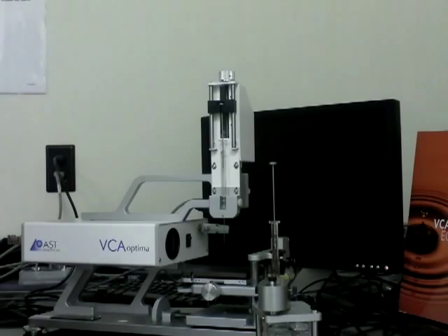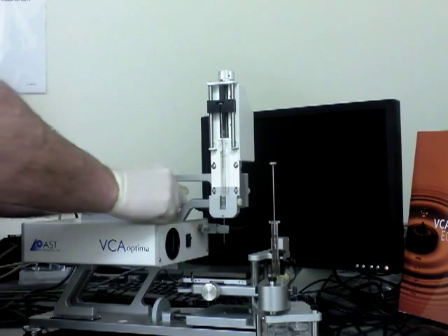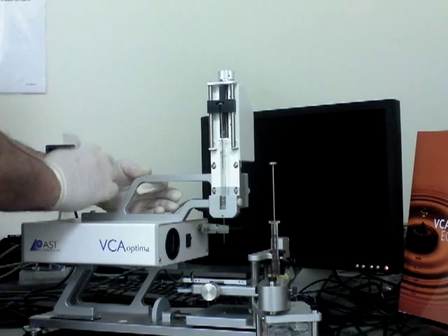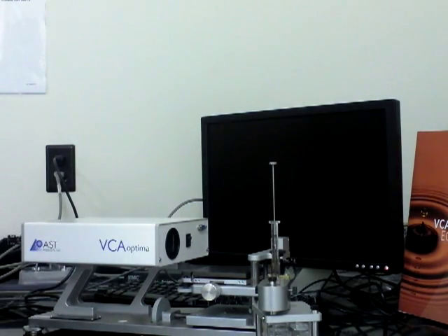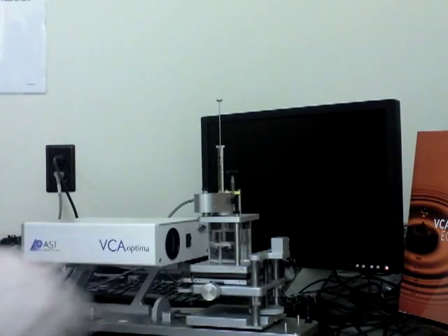I'm going to start by removing the motorized syringe by taking out the two screws on top of the VCA. I'm then going to place the captive bubble accessory on top of the VCA. And now it's ready for use.